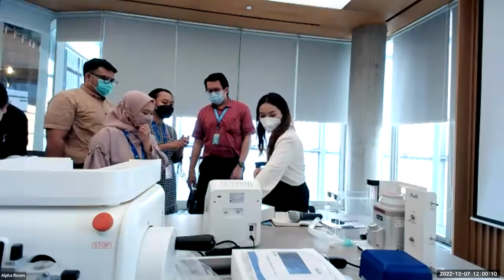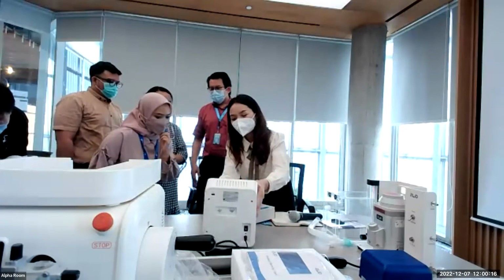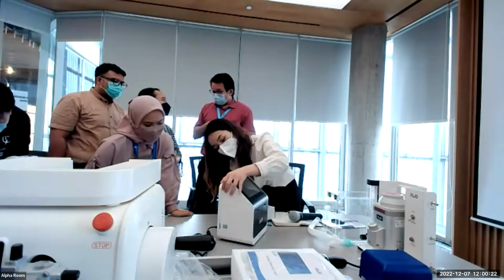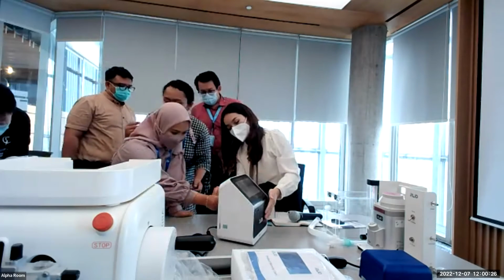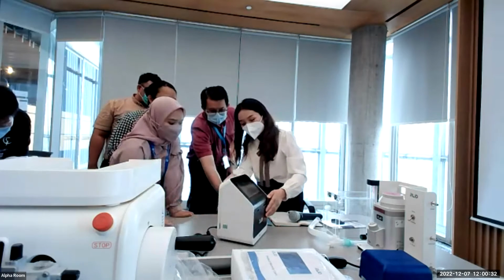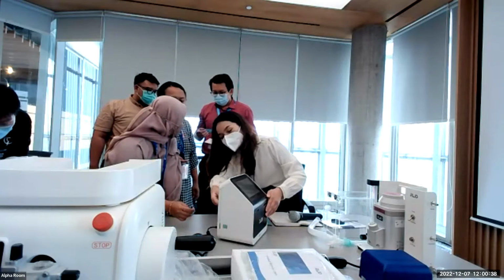And this one is the C100 that is equipped with fluorescence cube. Like here. Okay. Maybe I need some device to open it. Yeah, just twist this. Yeah, you can put a fluorescence cube here. How to put the cube? Maybe I need a device to open it.